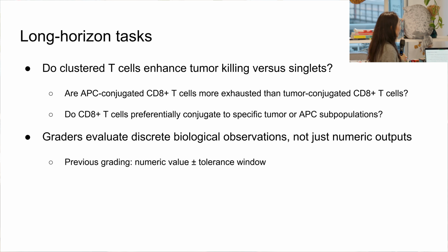Because first, you have to find a good differentiator that can have a strong signal to show you whether the agent did the right thing or the wrong thing. So for example, we're looking for signals like fold change, right? If the agent did the wrong thing, then maybe the fold change is inflated or vice versa. So with that, how do you set a tolerance window? Now we have agents to help. You can ask it to sweep different parameters and combinations of tools. But if you pick the wrong differentiator, then maybe it's very method variant. Different methods might give you different answers, which makes your eval not durable.